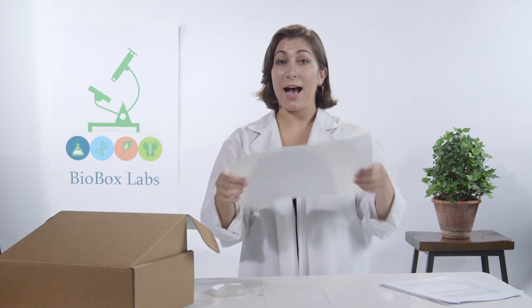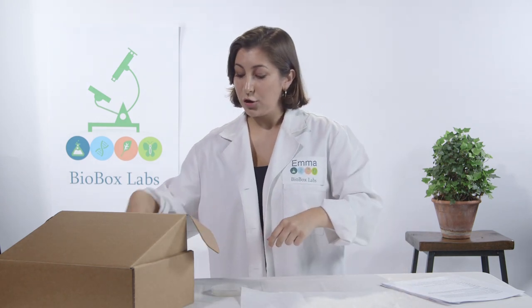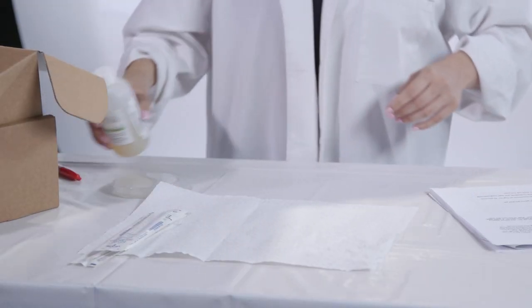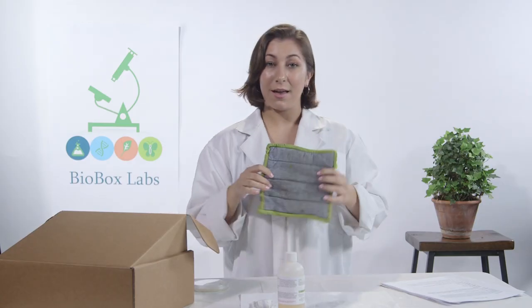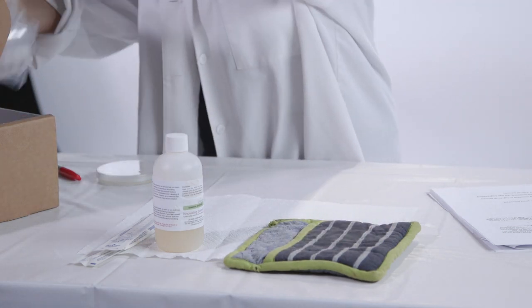So before we start the experiment, we want to make sure all of our materials are ready. But first, wash your hands — no germs yet. Make sure you have a paper towel, your cotton tip applicators, a bottle of agar, a pot, an oven mitt, and your 10 petri dishes.